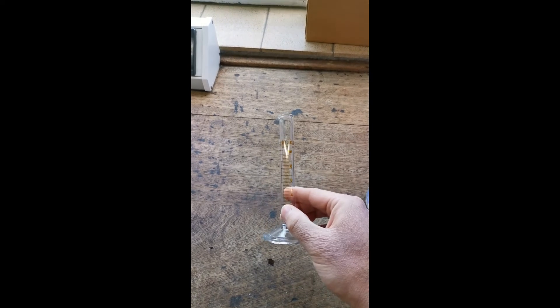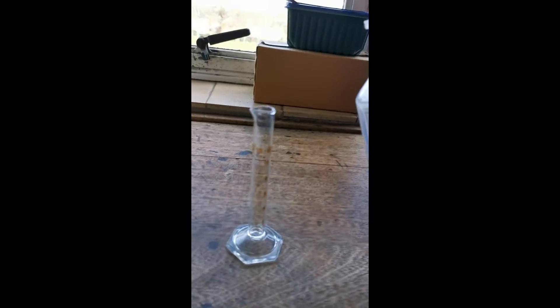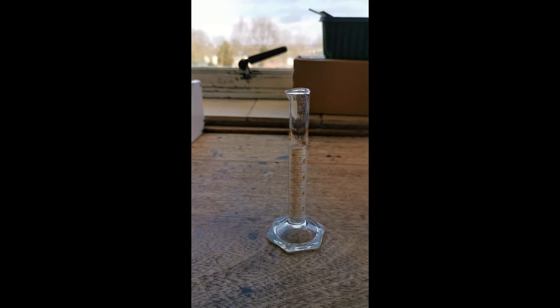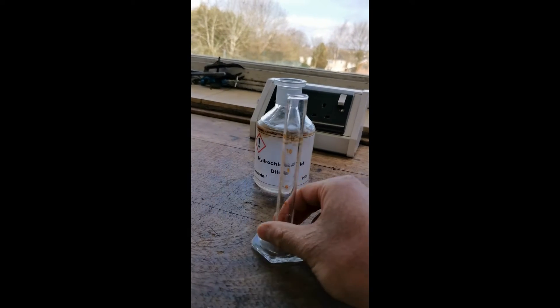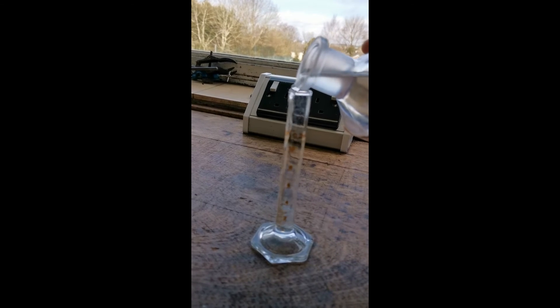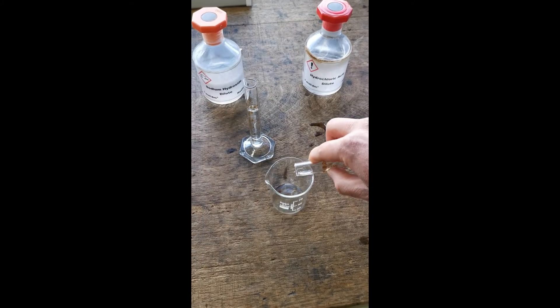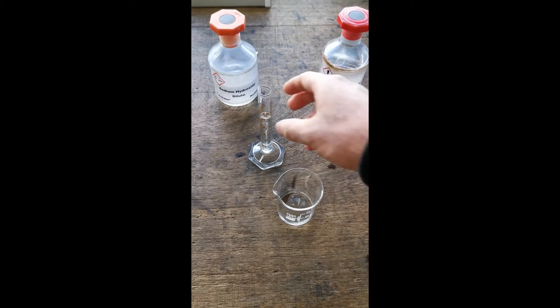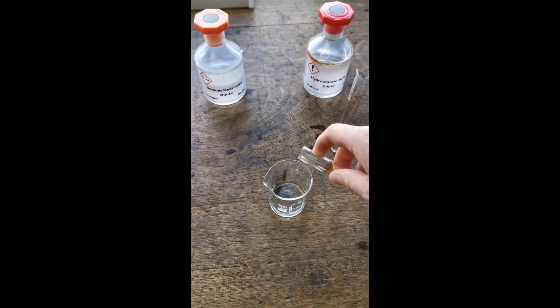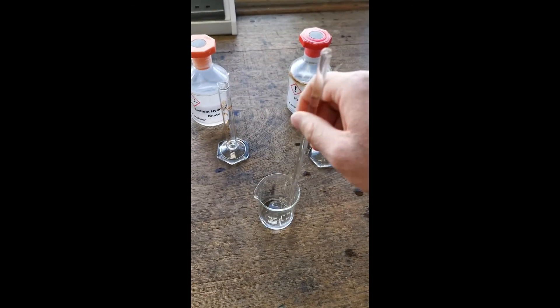Using a measuring cylinder I'm going to measure out 10 millilitres of sodium hydroxide, and then I'm going to measure out another 10 millilitres of hydrochloric acid. Now we're going to add the 10 millilitres of hydrochloric acid to the 10 millilitres of sodium hydroxide, and we're going to stir it using a stirring rod for one minute.